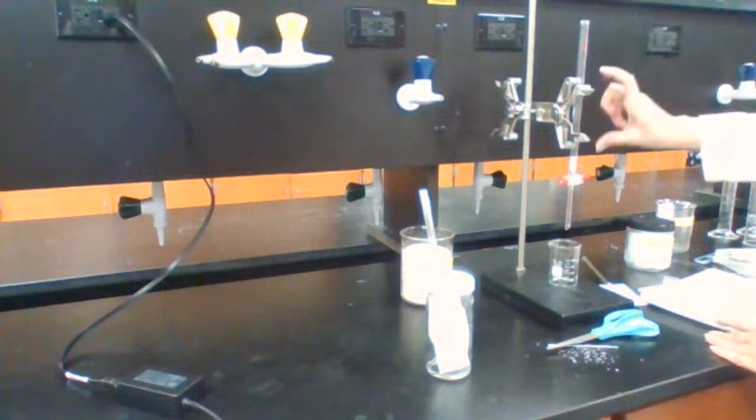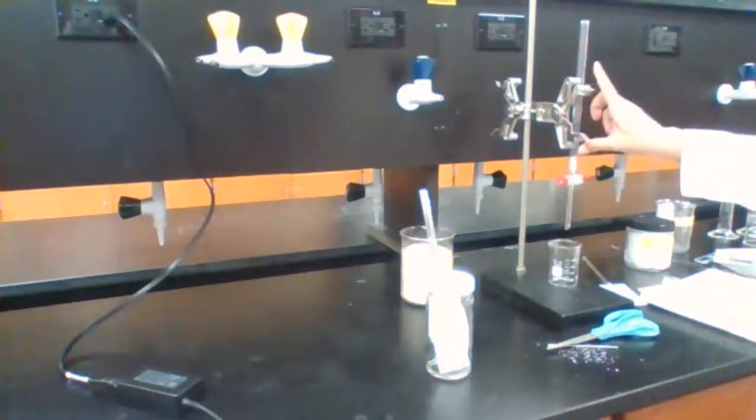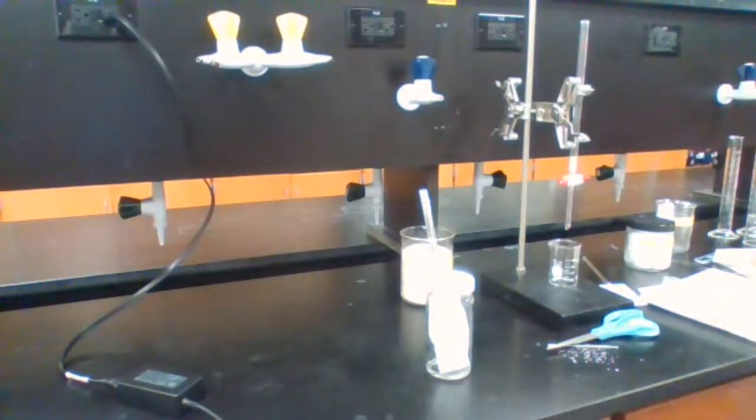So I'm going to use hexane, based on step 2 of the preparation of the column on page 68 of your lab manual. Going to bring some hexane for that.